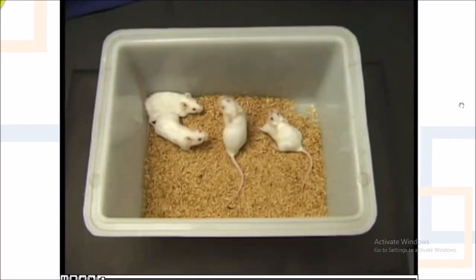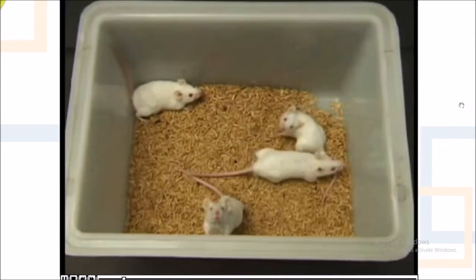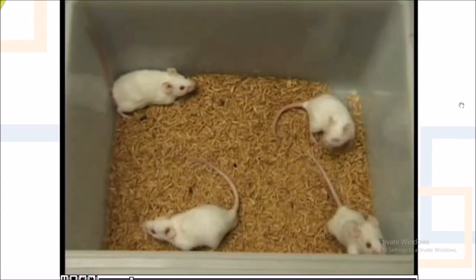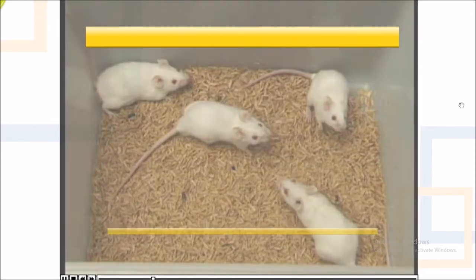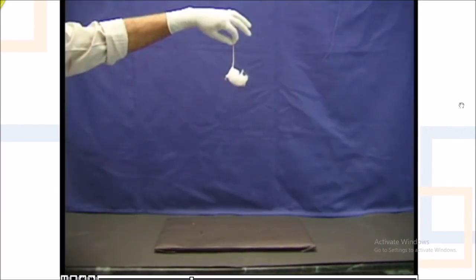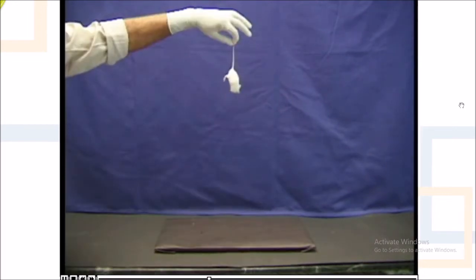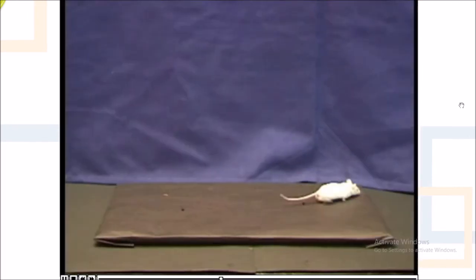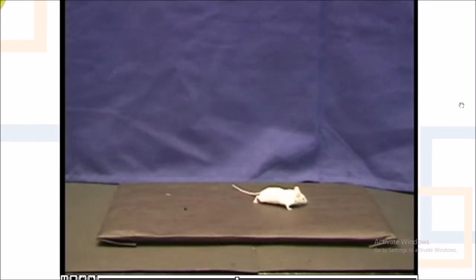To study the effect of sedative hypnotics in mice by writing reflex method, select three adult healthy mice of either sex weighing not less than 20 grams. Writing reflex means the ability of an animal to maintain and regain the body balance or posture. Drop the mice individually from a predetermined height and observe the writing reflex in each of them. The mice regain their normal posture quickly, indicating presence of writing reflex.